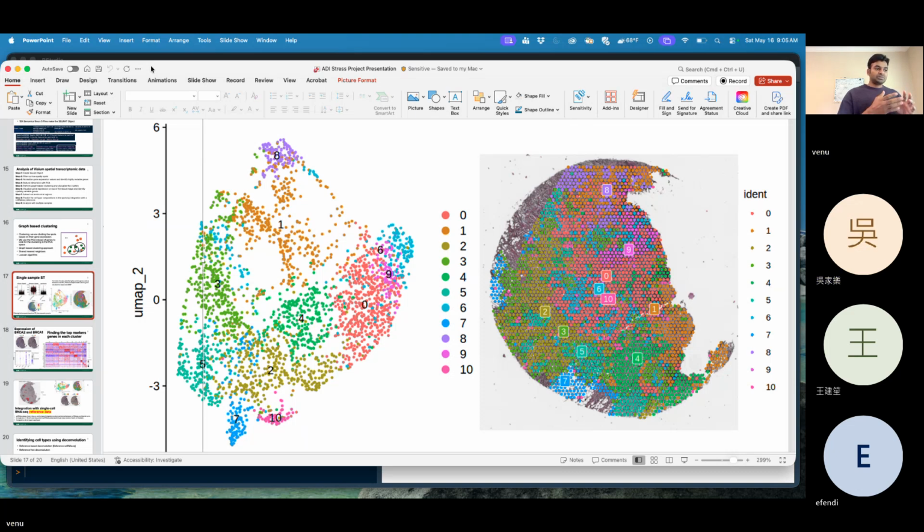So it will first look into what 1,000 genes in each spot are expressed. Each spot has its top expressed markers, suppose top 100 or top 1,000. First we have spot level expression, so we know the top expressed markers based on their expression level. Then it will go to another spot and look at its top markers. Like that it will go through the 1,000 spots.